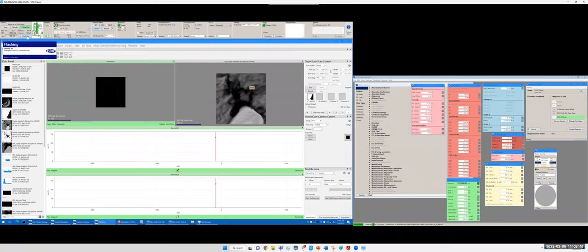You can see the beam is no longer showing on the Ronchigram camera because it is stopping the extraction voltage, so it's no longer emitting current. And after the current is stopped, it will pass a heating current to the tip to heat it up to remove contaminations.